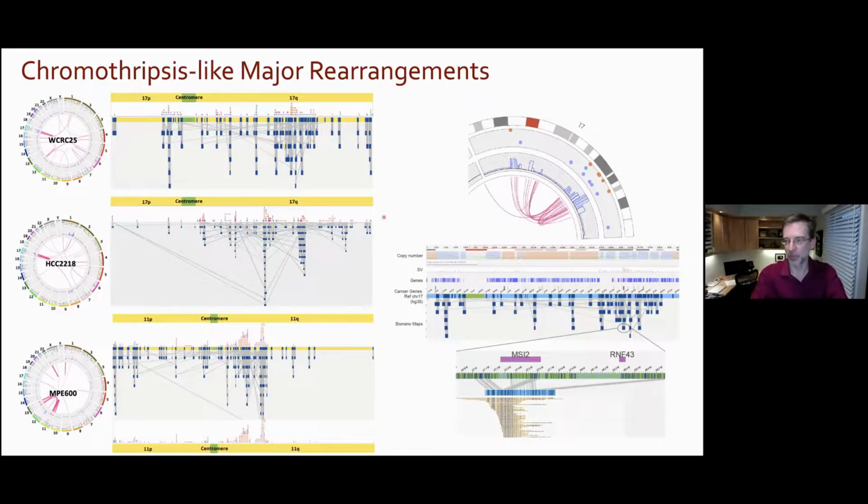And this is an example here where this gene here and this gene here have been turned around, reduplicated, put back together again. And you've basically scrambled not only the genome, but the transcriptome, and then ultimately the proteins that are getting made, with different fusions and different gene expression.